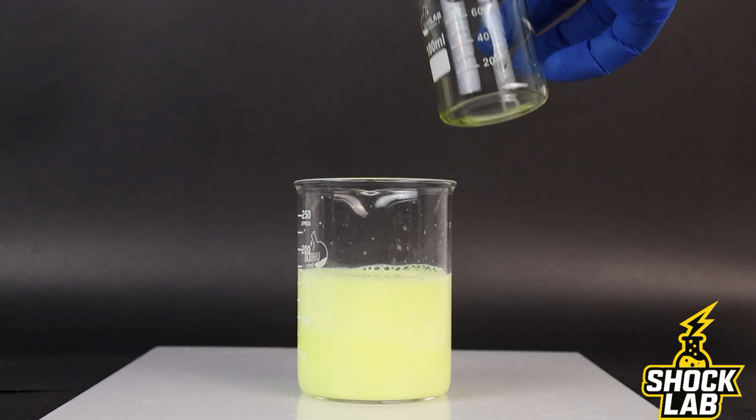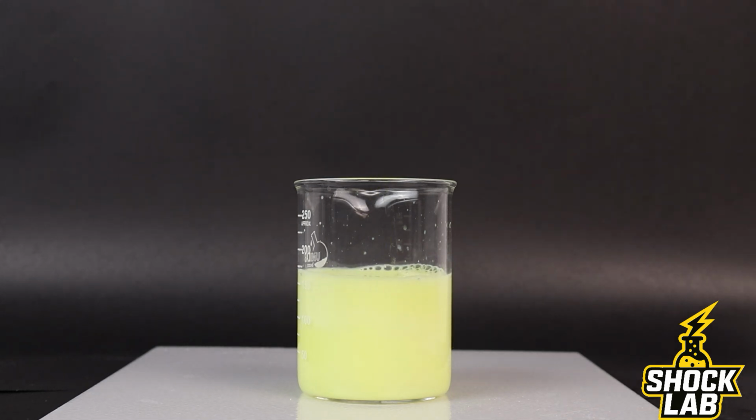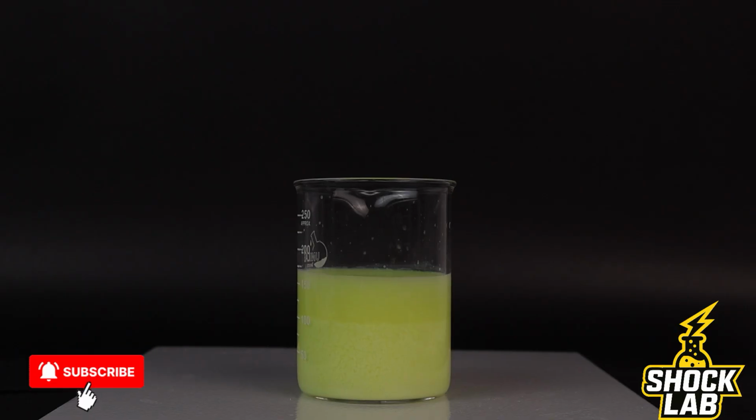Almost instantly, a bright yellow solid starts to form. This yellow precipitate is called barium chromate. The barium ions react with the chromate ions to produce an insoluble compound.